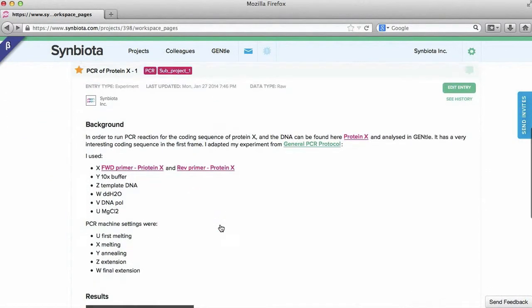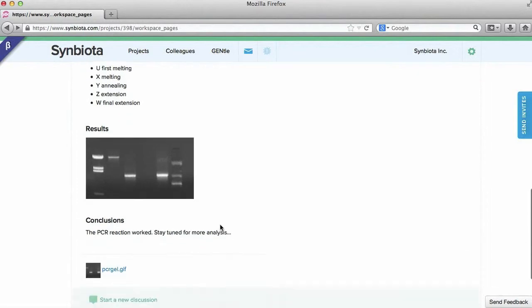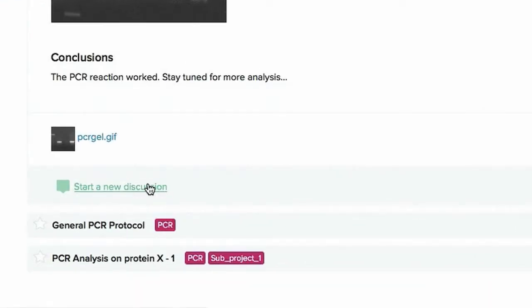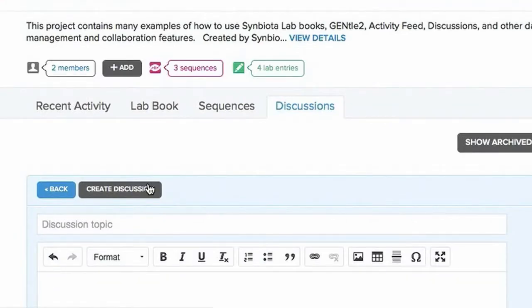You can start a discussion from one of your or your collaborator's lab book entries by clicking the speech bubble underneath the entry.